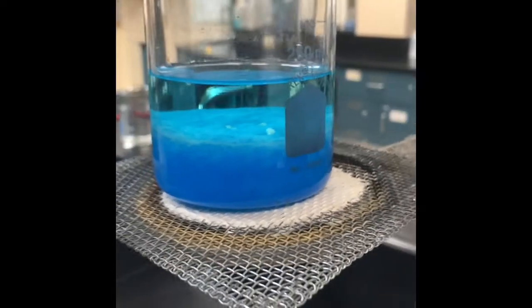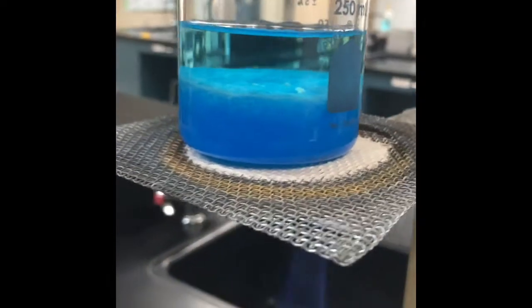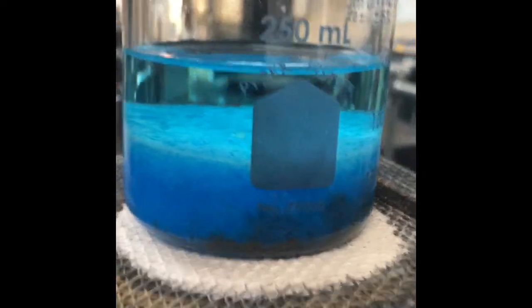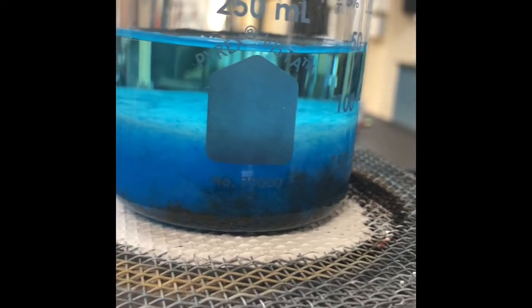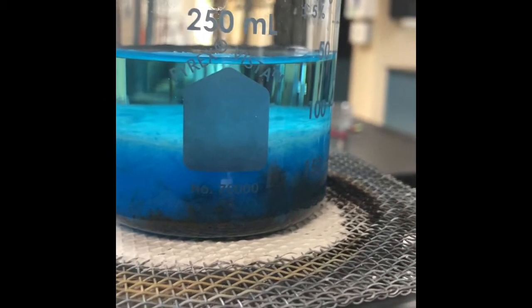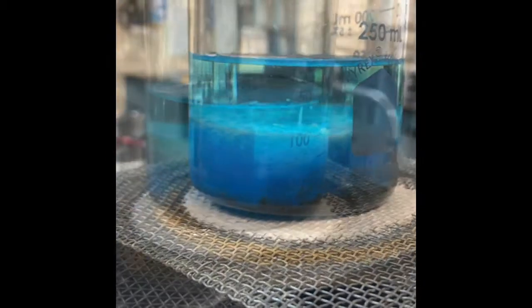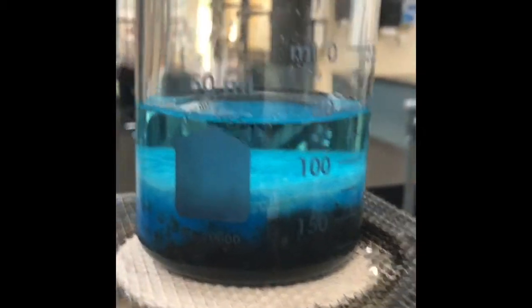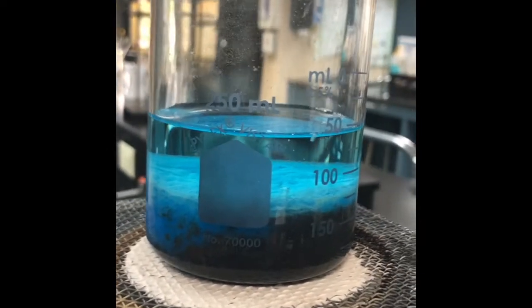Here is the copper 2 hydroxide, and it's on the Bunsen burner, and we're heating it up. So it'll take a little bit of time to start seeing some sort of change, but there will be a change that occurs. Some sort of change going on at the bottom, in the appearance of the copper 2 hydroxide. Okay, see, it's going. As it continues to heat up, we start seeing this brown solid forming on the bottom. Okay, so we're going to keep going until it's all completely turned brown.